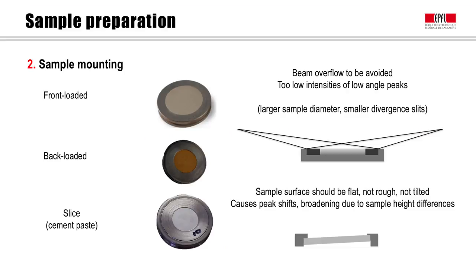Especially for phases that show high peaks in low-angle regions, such as ettringite or AFM phases, this beam overflow problem will lead to an underestimation of their content in quantitative phase analysis. Other requirements are that the mount surface should be flat, without roughness and not tilted, in order to avoid peak displacement or broadening associated with sample height differences or misalignment.